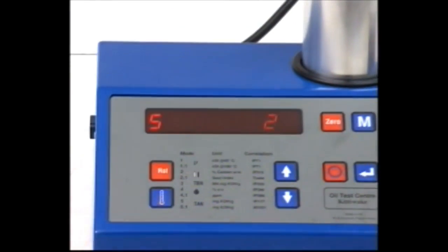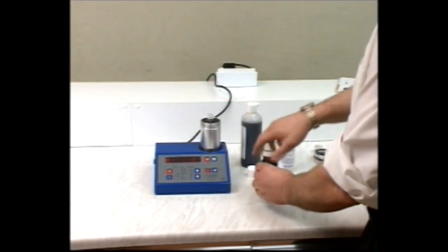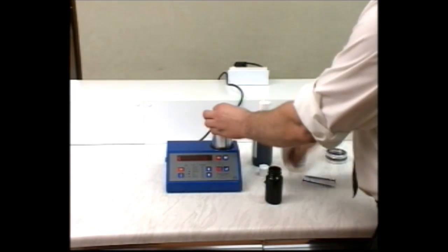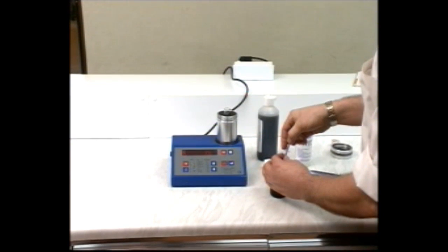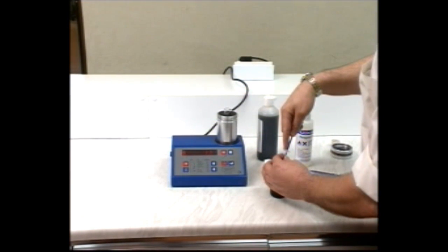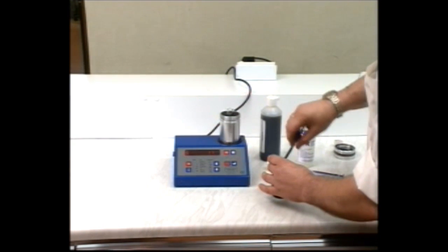Shake the oil sample well. Remove one milliliter of oil with the syringe and add it to the TAN tube.